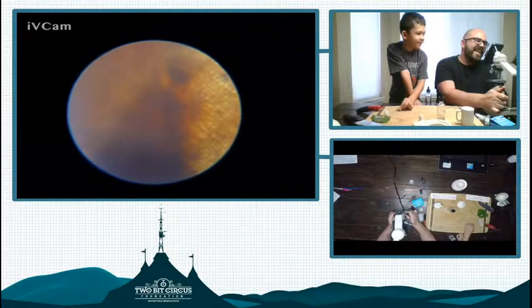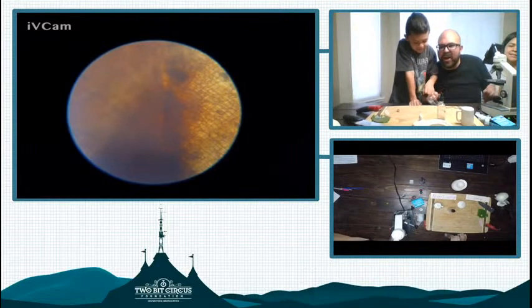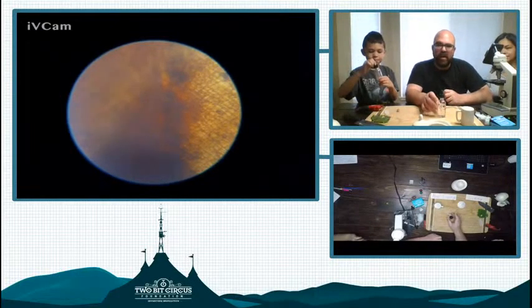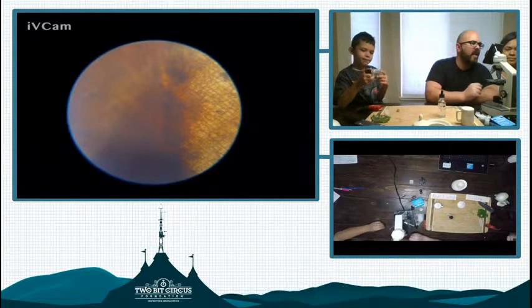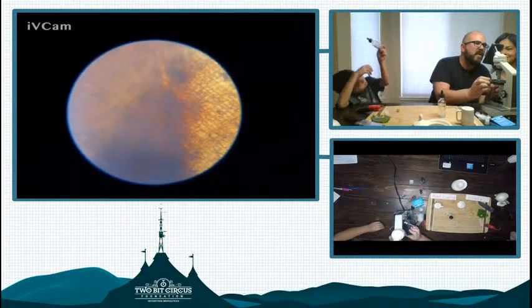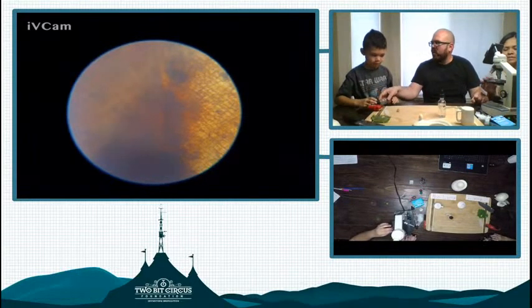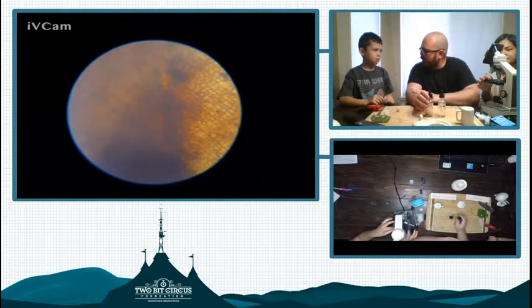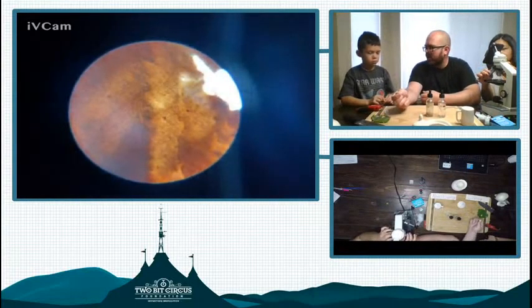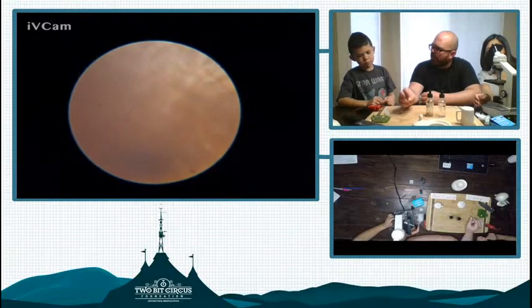Onions. I think that's pretty clear. On the right side there, remember, don't spill water, please. On the right side there, you can see a little bit of a pattern from the cork. And so the cork actually does have cells. I love doing that with the light. The cork does have cells. So Robert, where does cork come from? It has cells, so the cork had to be living. It's probably not alive now, because it's dried out and dead. But it was alive at some point. So where does cork come from?